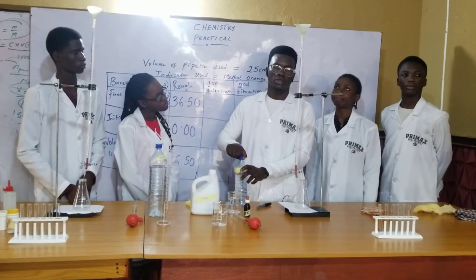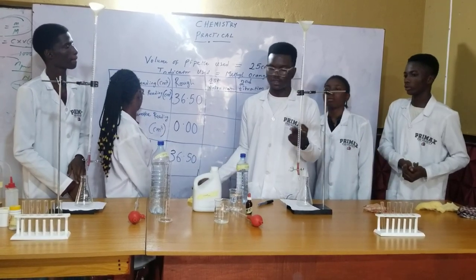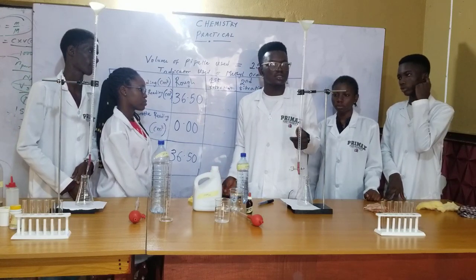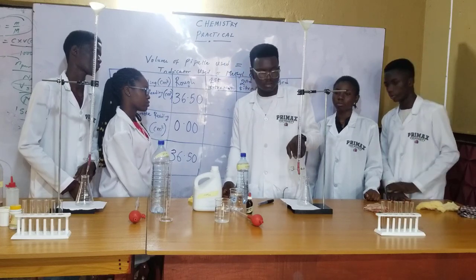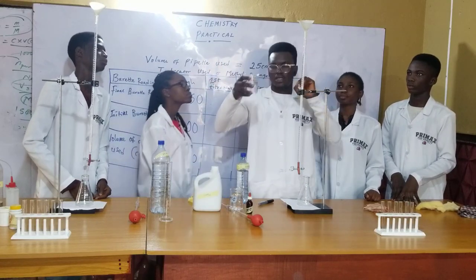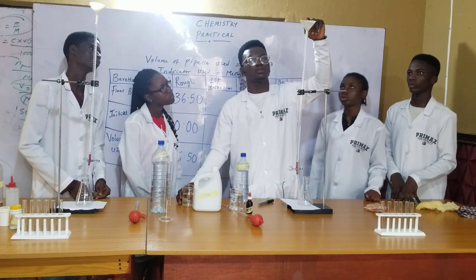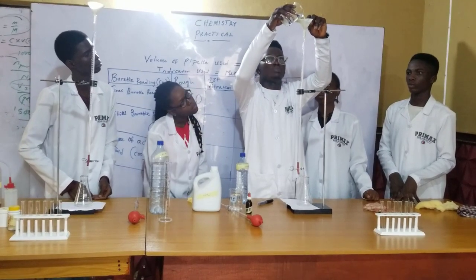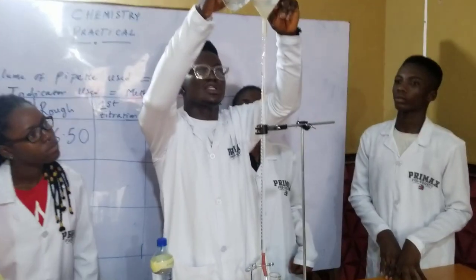You can start your initial reading from 36.5, but since this is 36.5 and the next reading might go to 60 something — which would fall below the 50 ml mark — you have to refill the acid. So you refill the acid to the zero mark. Also, when you are done filling, make sure you remove the funnel. When I removed the funnel, some liquid dropped — that would have added to the volume, which is a significant error.